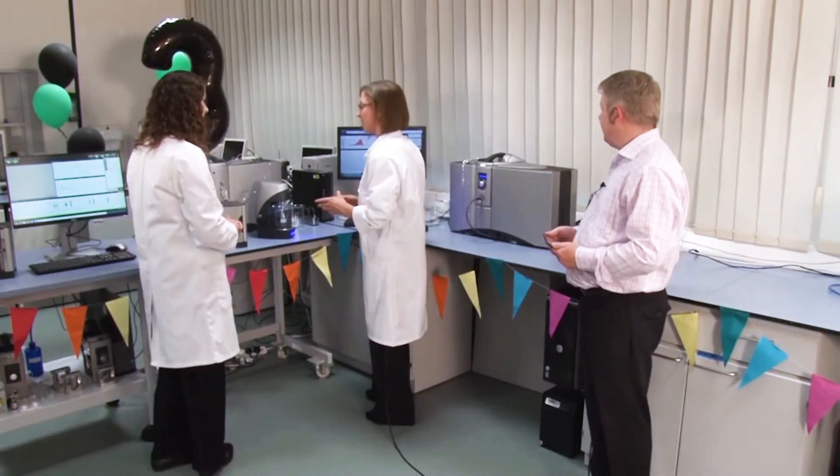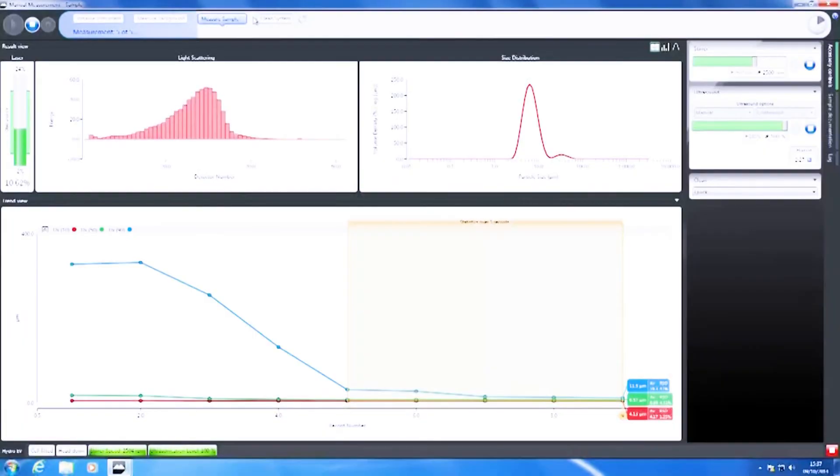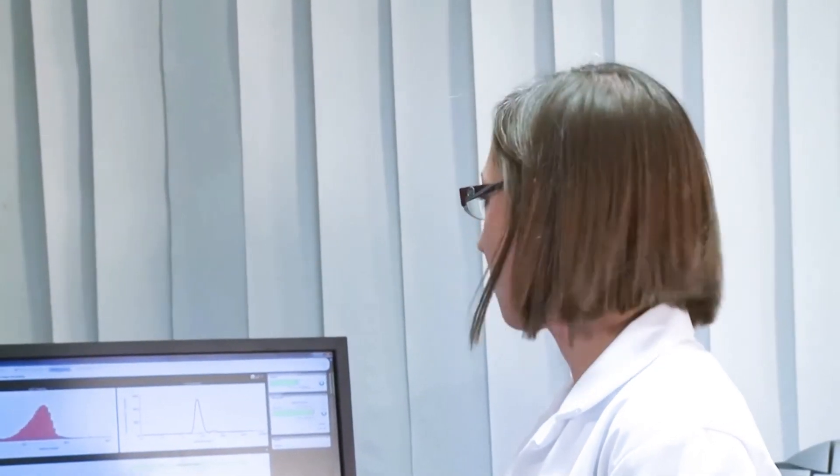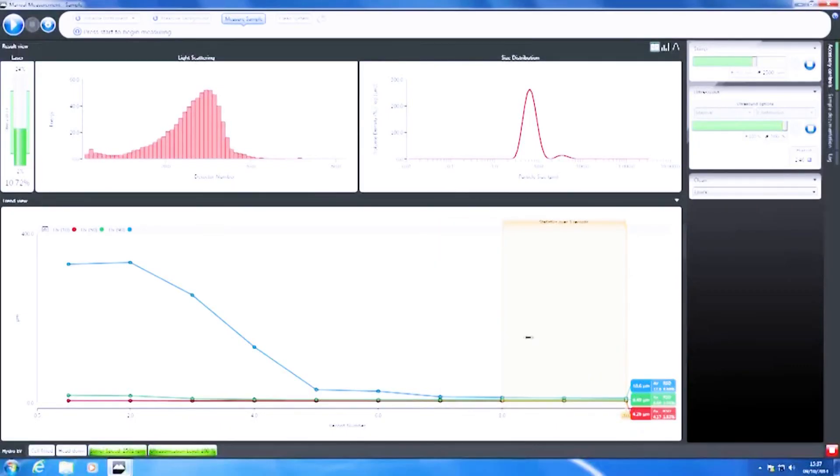So what the master size is showing us, as well as the size distribution, it's building up a trend of the d10, d50, d90. So this trend view is showing us the size parameters against time as we've been applying the ultrasound. So at the beginning, when we didn't have anything on, it was pretty large. And as soon as we turn on the ultrasound, it starts to decrease pretty quickly, and we're getting down towards the stable particle size now. The last few measurements show the size hasn't changed a huge amount.